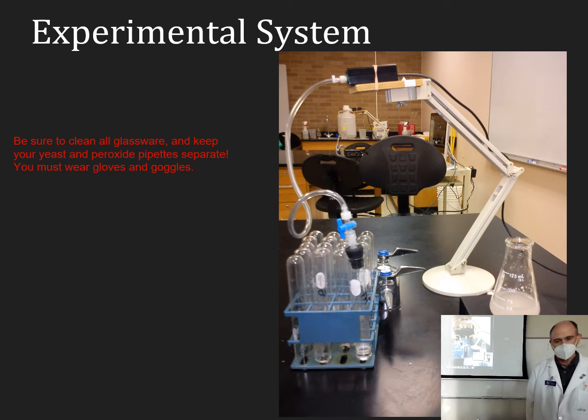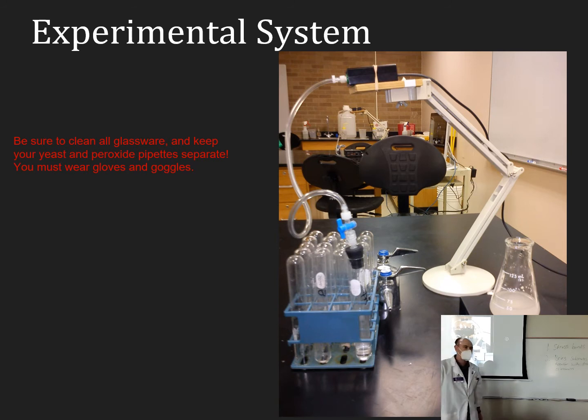Atmospheric pressure. It has a stopper at one end that will fit into test tubes. Okay? You also have a stir plate at your bench, which is that black box. And there should be a stir bar on top of it, a little magnetic bar.